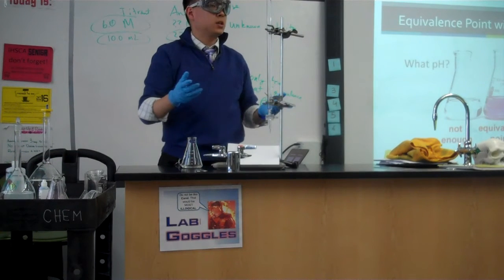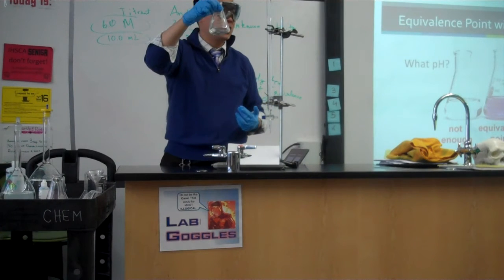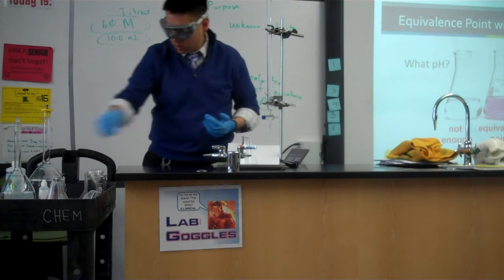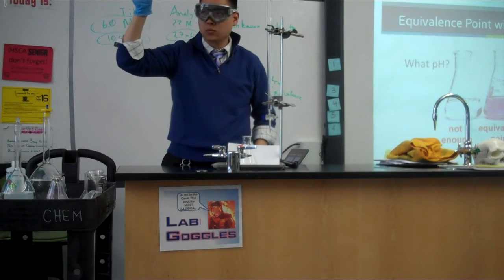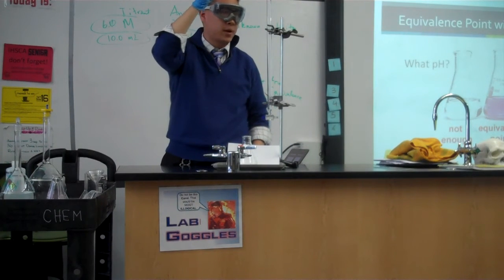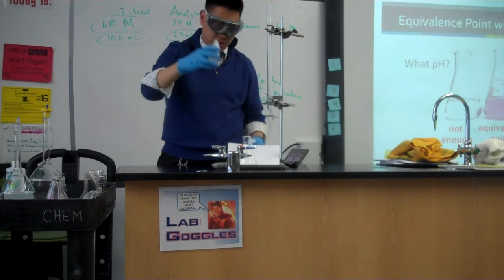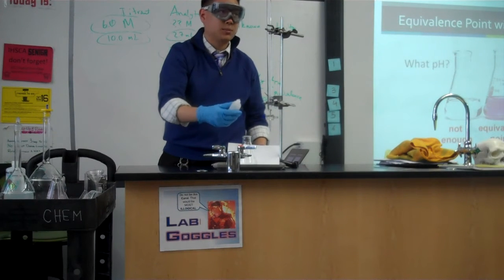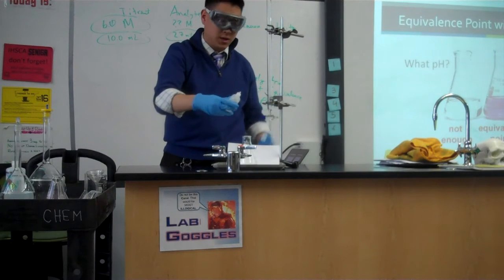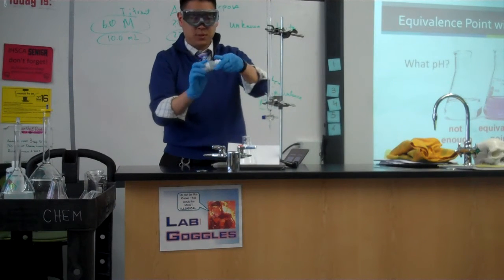Now, in order to observe the color change, we need something that will change color. Right now, this will not change color. So, we're going to add 3 drops of phenolphthalein, which is our pH indicator. We can check spelling later. We're going to put 3 drops. 1, 2, 3. Now, because it's going to be harder for you all to see from where you're sitting, I'm going to add about 5 more. Phenolphthalein. I'll put the spelling on the board.